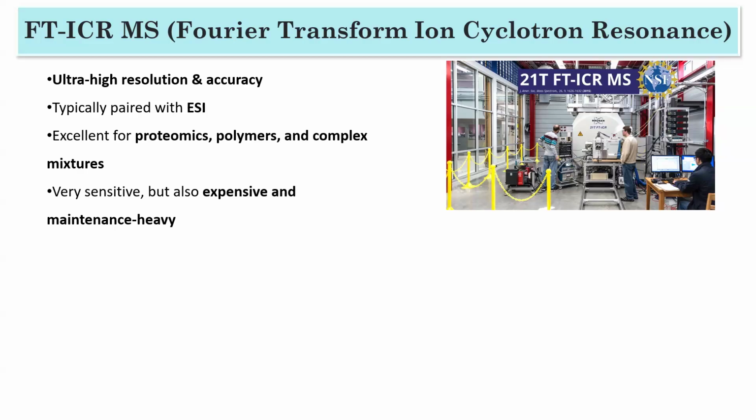Then Ratu is asking why a matrix is needed. See, as I told you, in your MALDI, for example, you need some matrix because we want to use some laser.